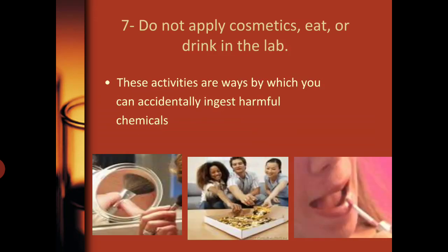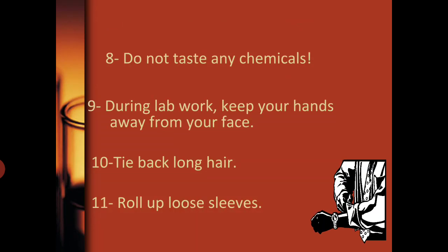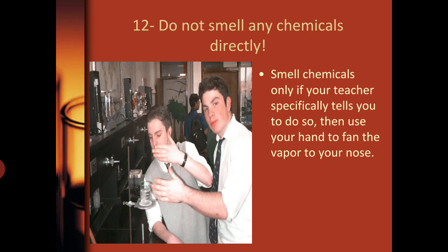The seventh one, do not apply any cosmetics, do not eat or drink in the laboratory. Doing these kinds of activities may lead to an accidental ingestion of harmful chemicals. Do not taste any chemicals in the laboratory. During lab work, keep your hands away from your face and tie back your long hair. Roll up your long sleeves. Do not smell any chemicals directly.